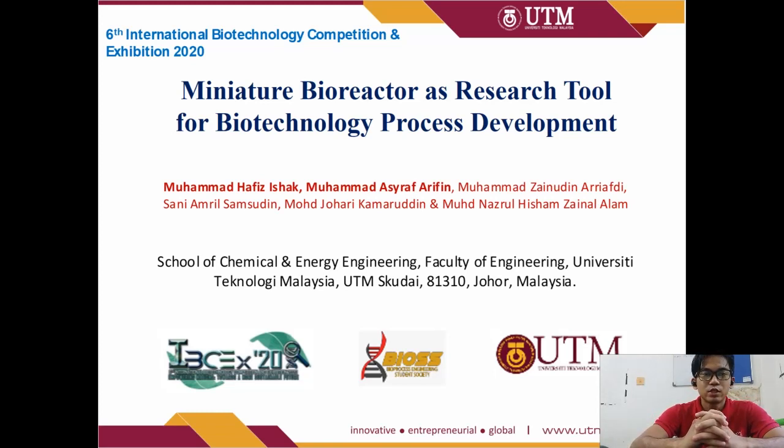My name is Muhammad Ashraf bin Arifin from 4SKTK School of Chemical Engineering, University Technology Malaysia. I'm going to talk about our project here, which is the miniature bioreactor as research tool for biotechnology process development. This project is supervised by Dr. Nazrul in collaboration with Dr. Sani and Dr. Johari, with a few contributions from my friend Muhammad Zainuddin and Muhammad Hafiz.